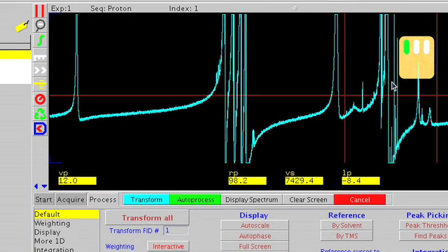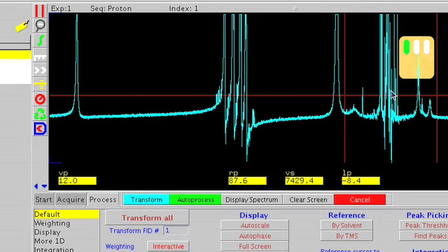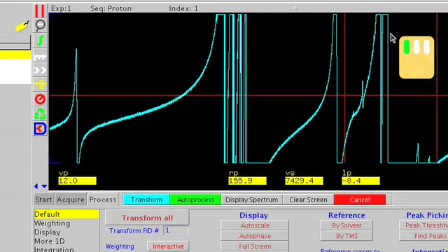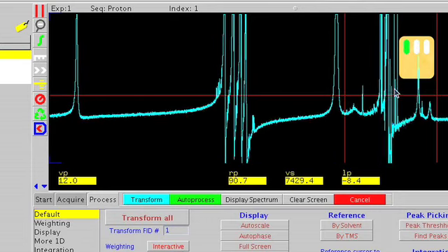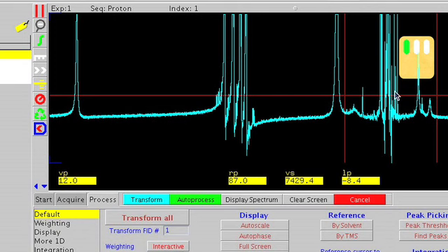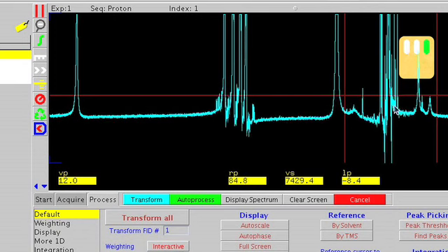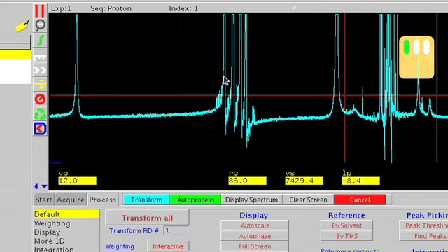See how I drag the mouse up and down, holding the left button down, the phase of the spectrum is changing. Also see that RP, shown at the bottom, is the only phase being changed. The left button is a coarse change to the phase. If I drag with the right button, the phase change is smaller. The middle mouse button controls the vertical scale.